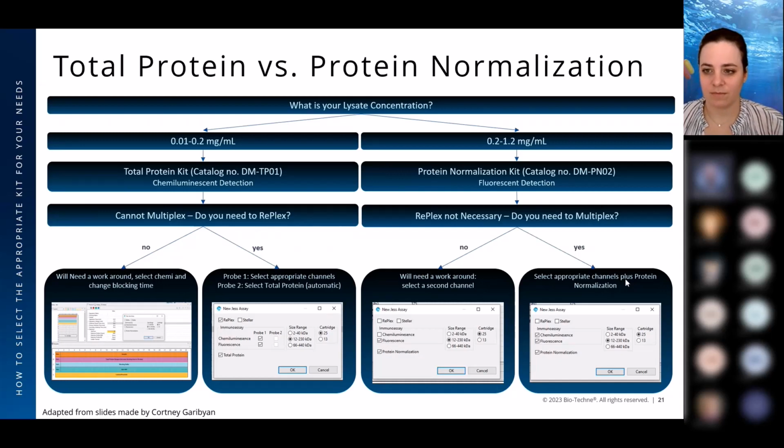So it's most appropriate to compare them, basically testing them out for those different lysates. That being said, if you look at our app note, if you're testing different tissues, you're going to get more consistency with a total protein than you would with a single reference housekeeping gene. So I guess the intent of this technology is to be an improvement over a single protein technology detection rather than an absolute replacement for BCA or something like that. Hopefully that helps.